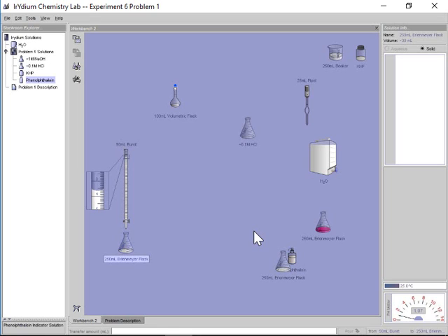So this one here, my burette looks like it's 3.67 plus or minus 0.05. I'm going to toss in 30. That should be safe. So you just unload 30 right away. That's what your first trial said, approximately what it was going to be. And then now what we're going to do is we're going to toss in maybe 0.5 at a time. So then this would be 30.5. So this would be 31, right? Now we're getting pretty close to the 32.43.